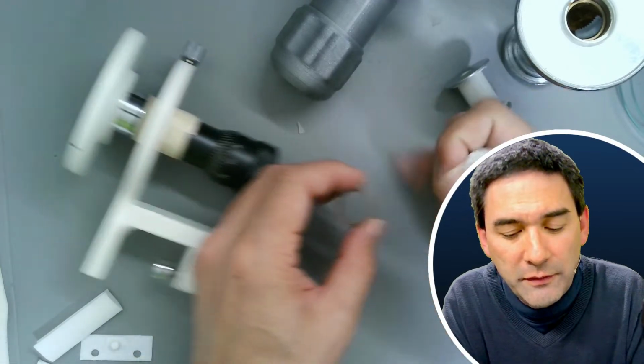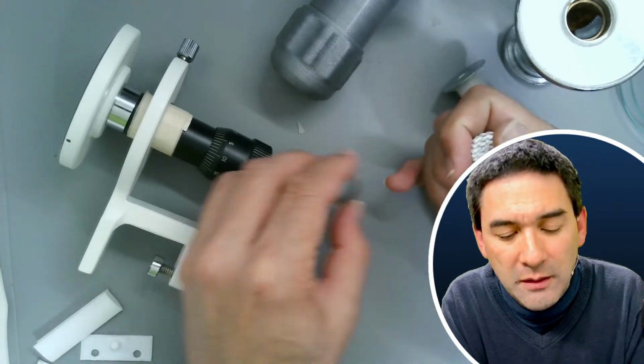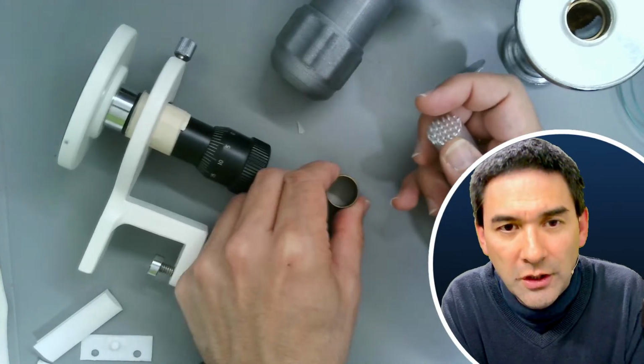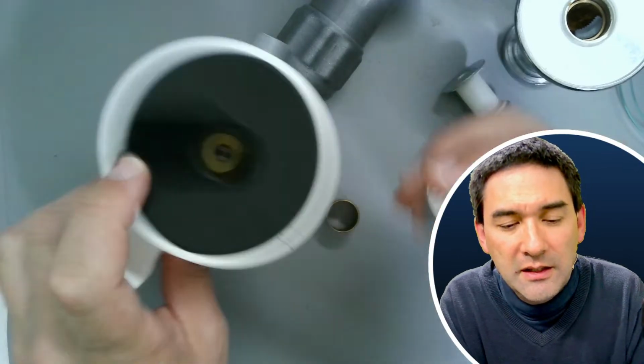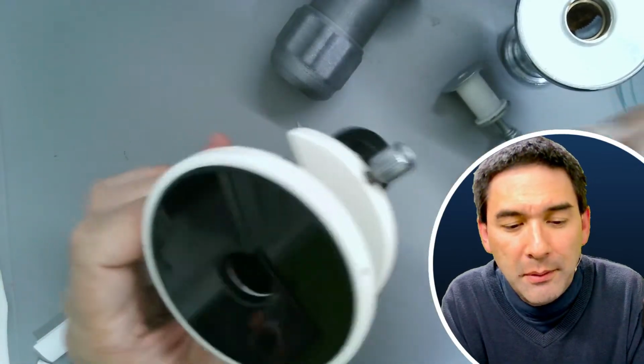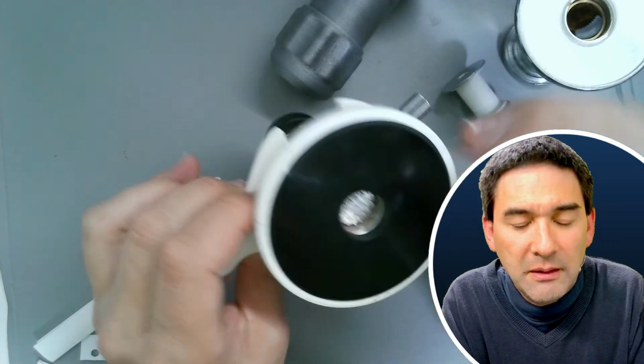So you have the specimen in paraffin, and then maybe like a cookie cutter you stamp it out, and then you melt it on here, and then it's also solid in here, and you don't need a clamp. Okay, I think that's the idea.